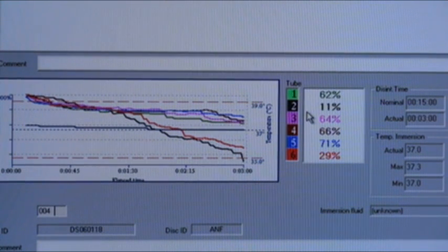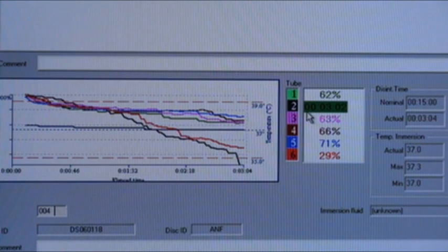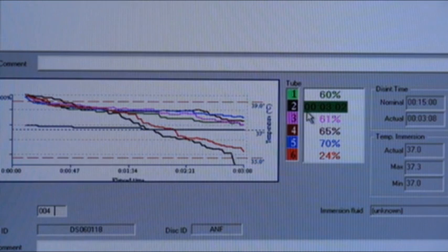The rate of disintegration based on the thickness of the tablet is shown here graphically. The box on the left shows the rate of disintegration. The box on the right shows the percentage left in each chamber to be disintegrated.